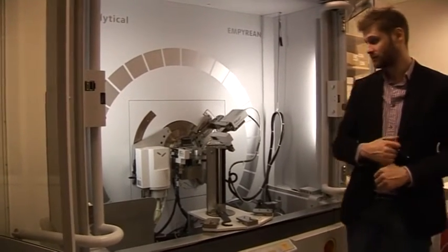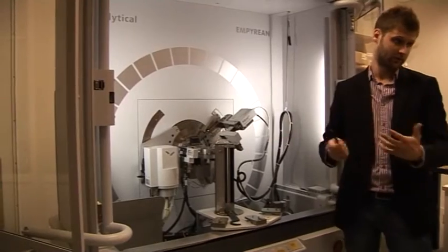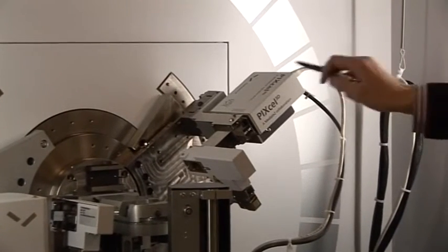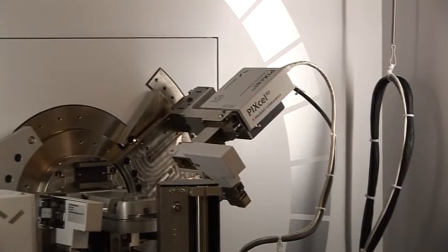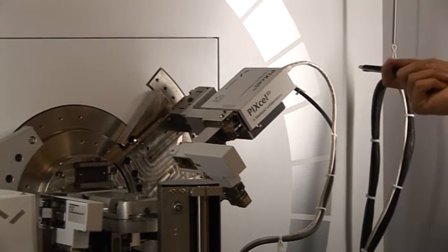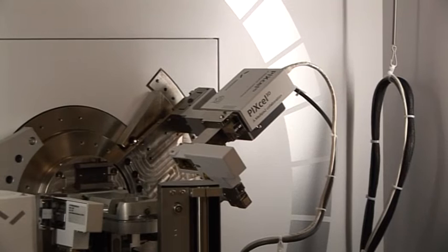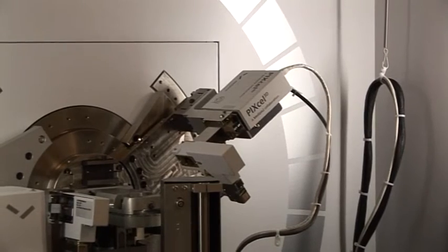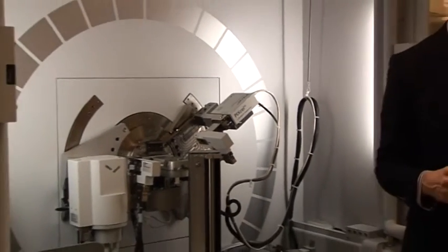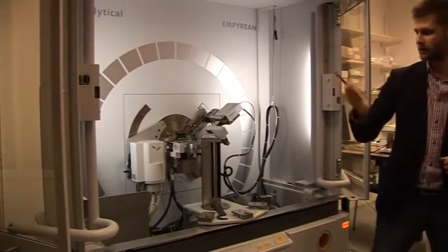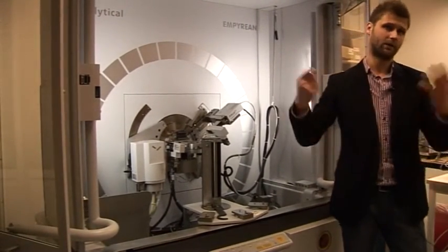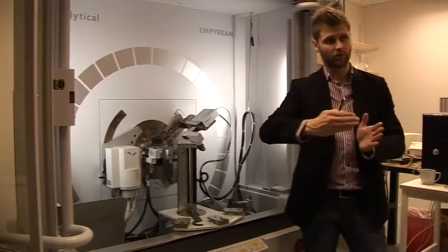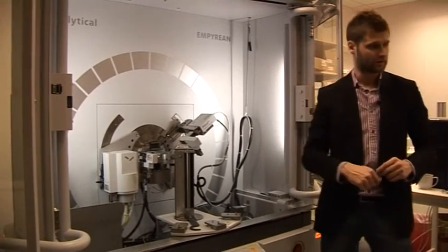The last part of any diffractometer is the detector. The main advantage of this machine is the detector because it is a very fast detector that detects a very broad range of X-rays at once. That is why the machine is very fast, it is the fastest I think in its kind at the moment. We can perform runs from 40 to 30 seconds and of course up to unlimited time. Usually the longer you scan the better data you get.